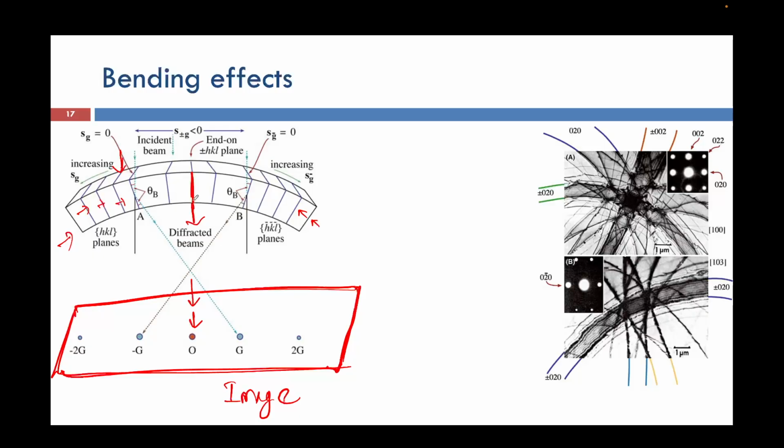So that is why many beams will be passing through my material, since they are not getting diffracted in a Bragg's diffracted condition. So in that case I will be getting intensity all over my sample, all over my image plane. However, whichever beams have been diffracted according to the Bragg's condition, in this case I was supposed to collect the electron beam. However, since it has been Bragg's diffracted in this direction, what I will get is a dark line.